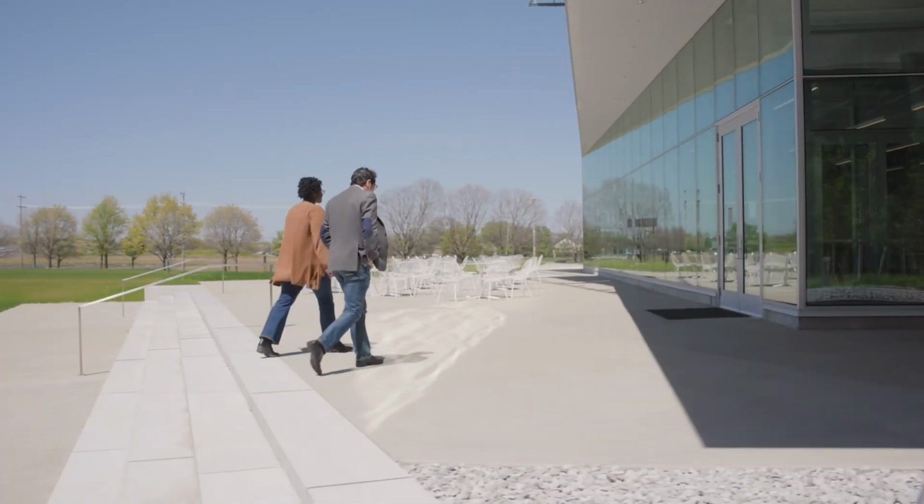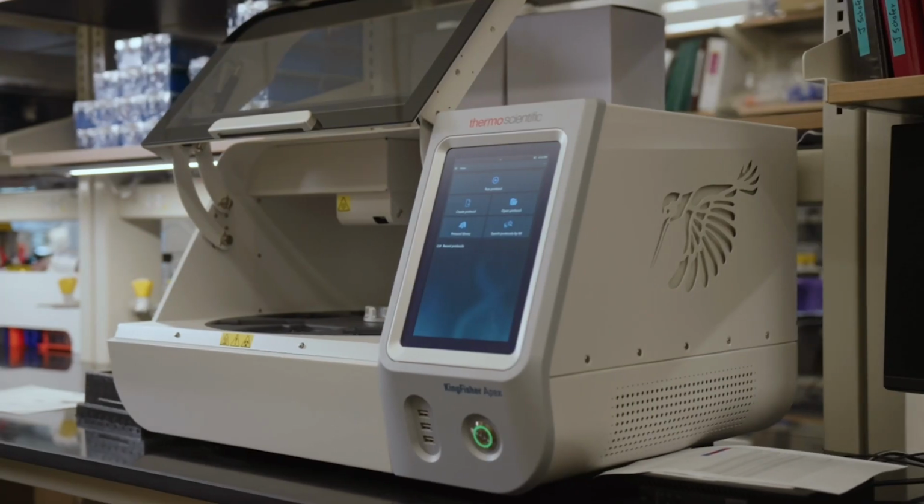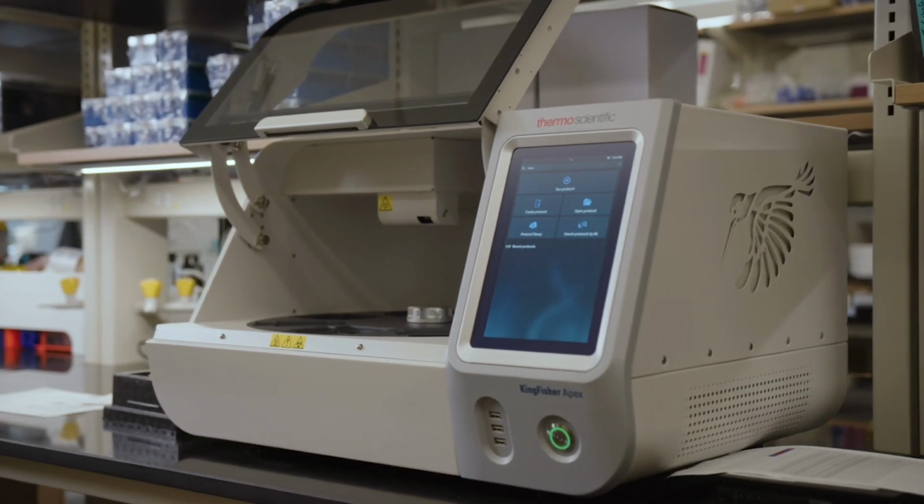We're a technology development lab focused on trying to make the best types of measurements and the best types of software for analyzing those measurements using a mass spectrometer. But we're interested in what's going on in the tumor microenvironment from an immune cell perspective. One of the problems with this type of experiment is that there are not going to be that many copies of each cell in that specific tumor.